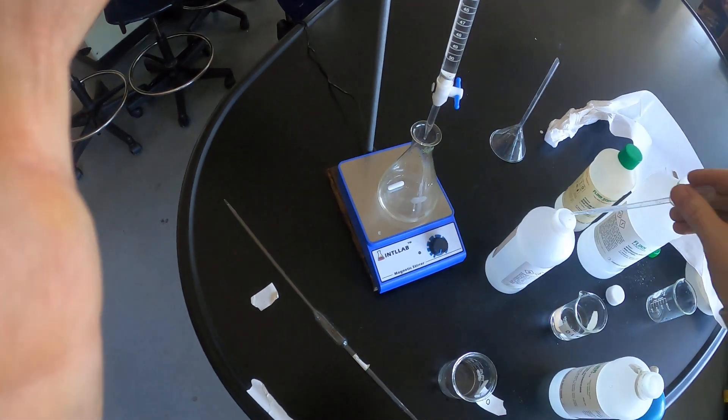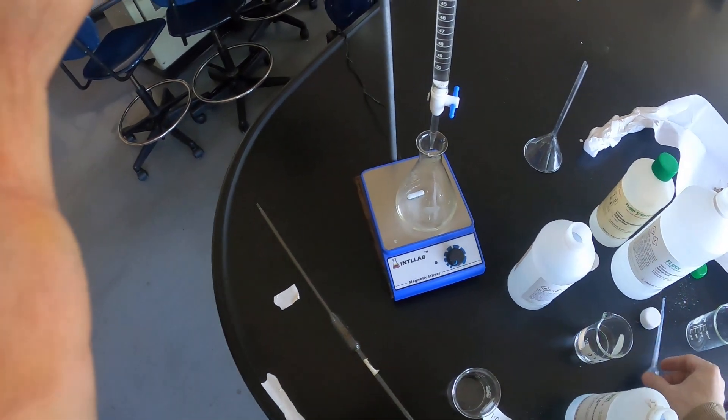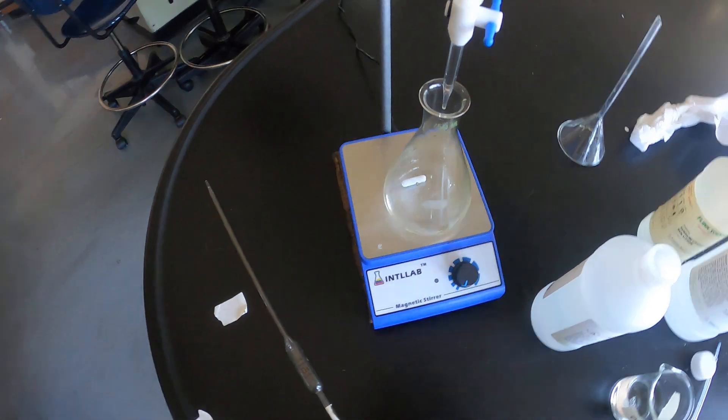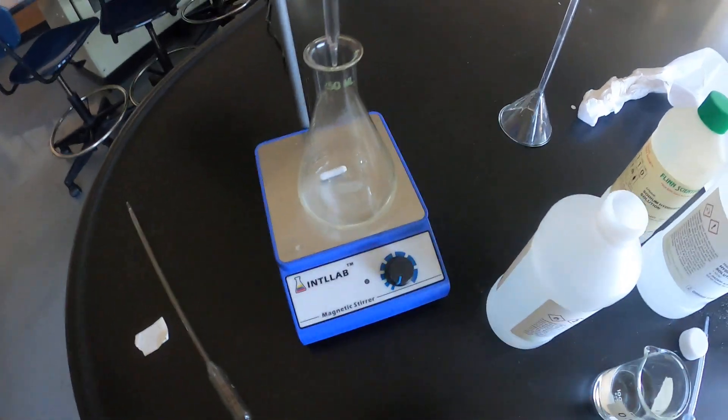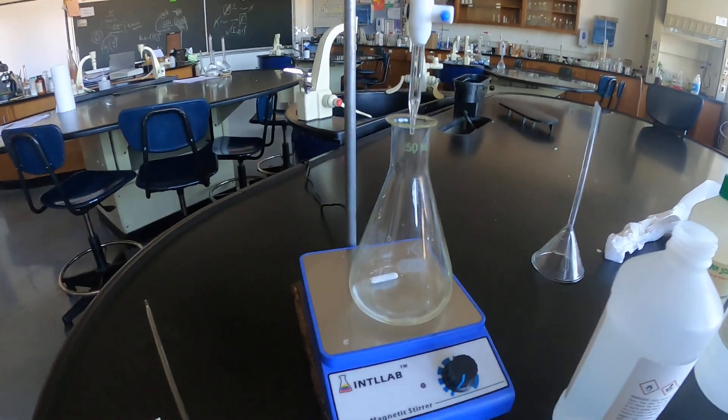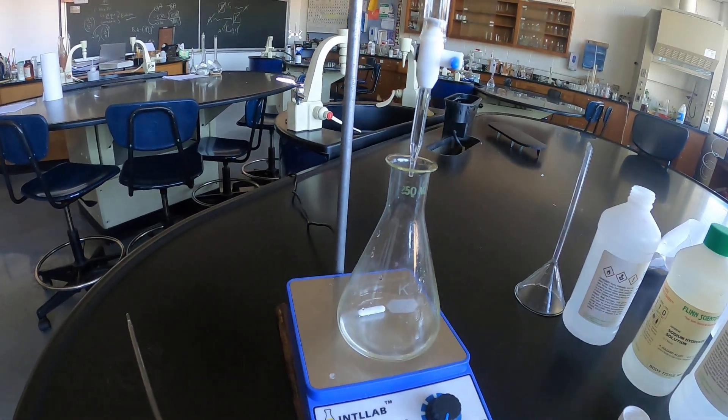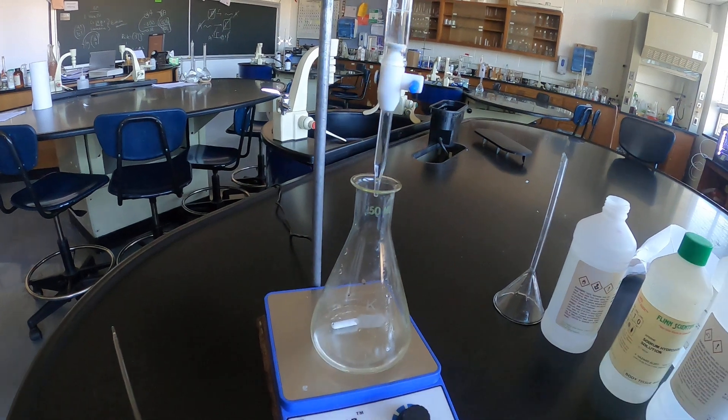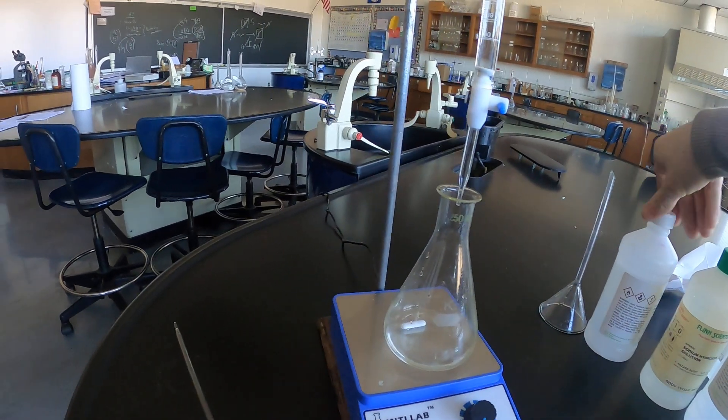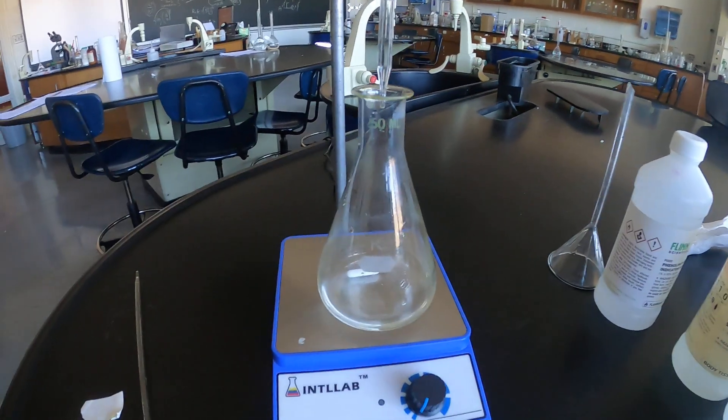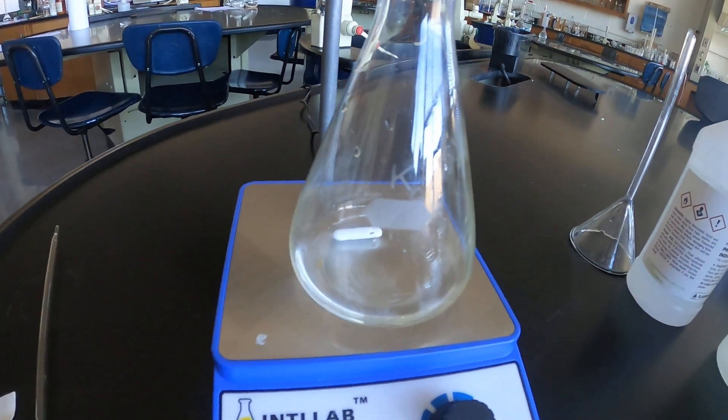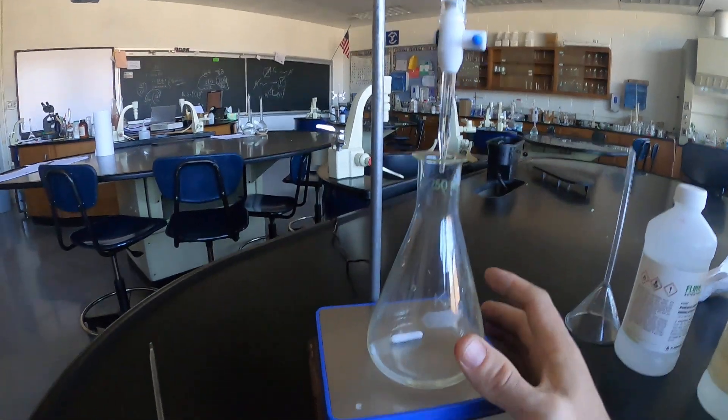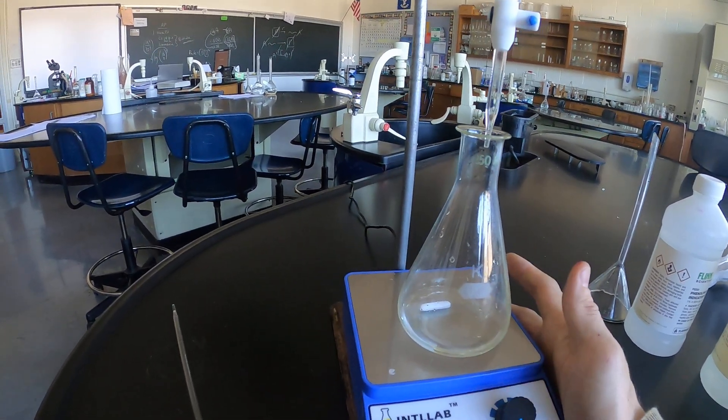Two to three drops of indicator is typically sufficient. So for this titration we know that phenolphthalein is clear in acids and it is pink in base. So we are going to be titrating this flask and this analyte to a permanent color of pink upon the addition of one drop. That maximizes the sensitivity of the instrument because the burette can only let one drop out at a time and we don't want to blow past the endpoint, otherwise it's just an incorrect determination. Now I'm going to be giving you acids and bases that are essentially equal concentration, therefore you can expect your endpoint to be in terms of the volume dispensed in the burette to be close to the volume that you've dispensed in the analyte which in this case is 20 ml.